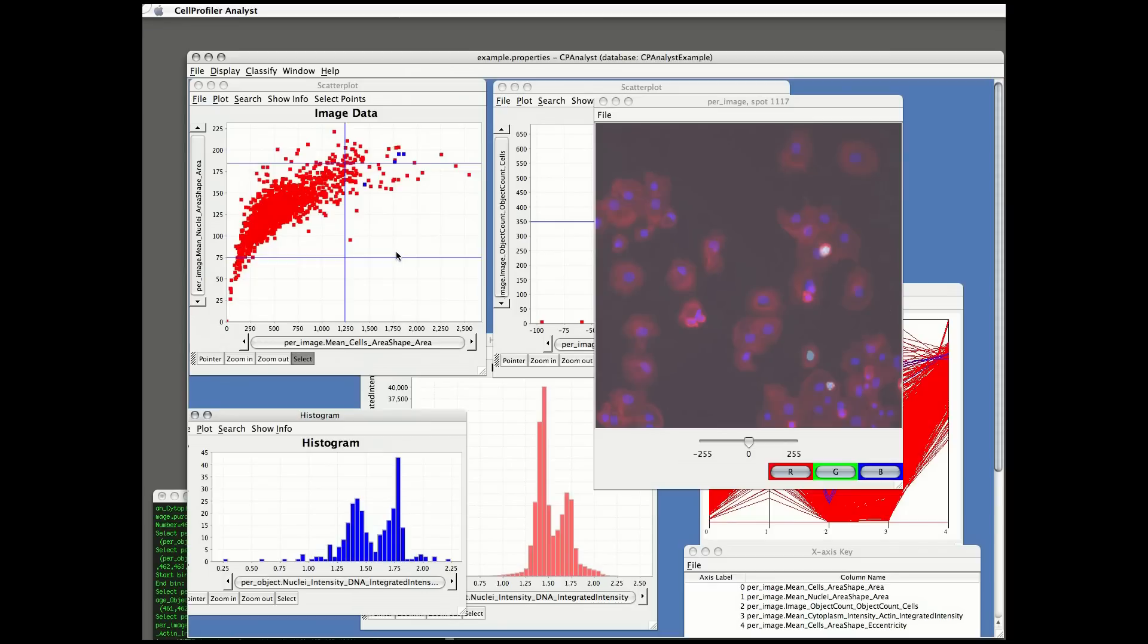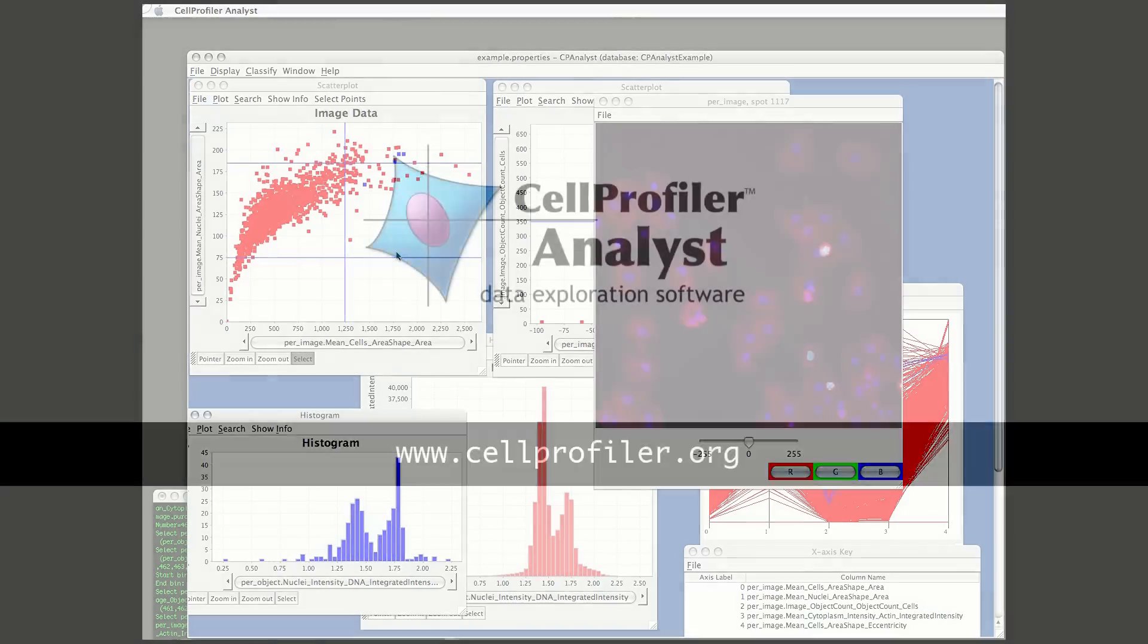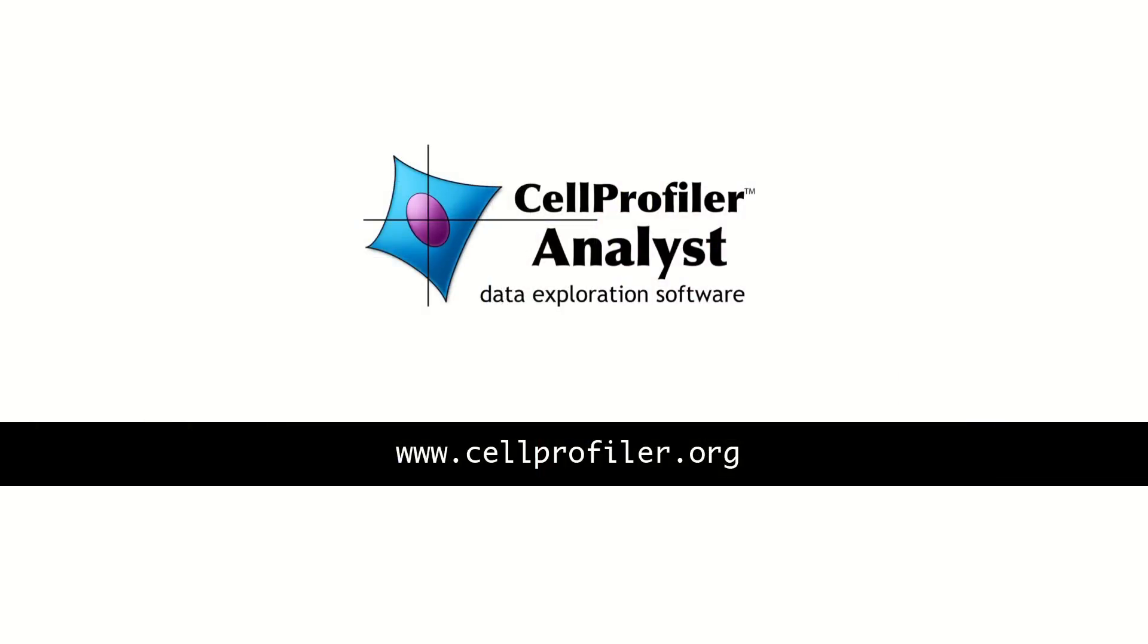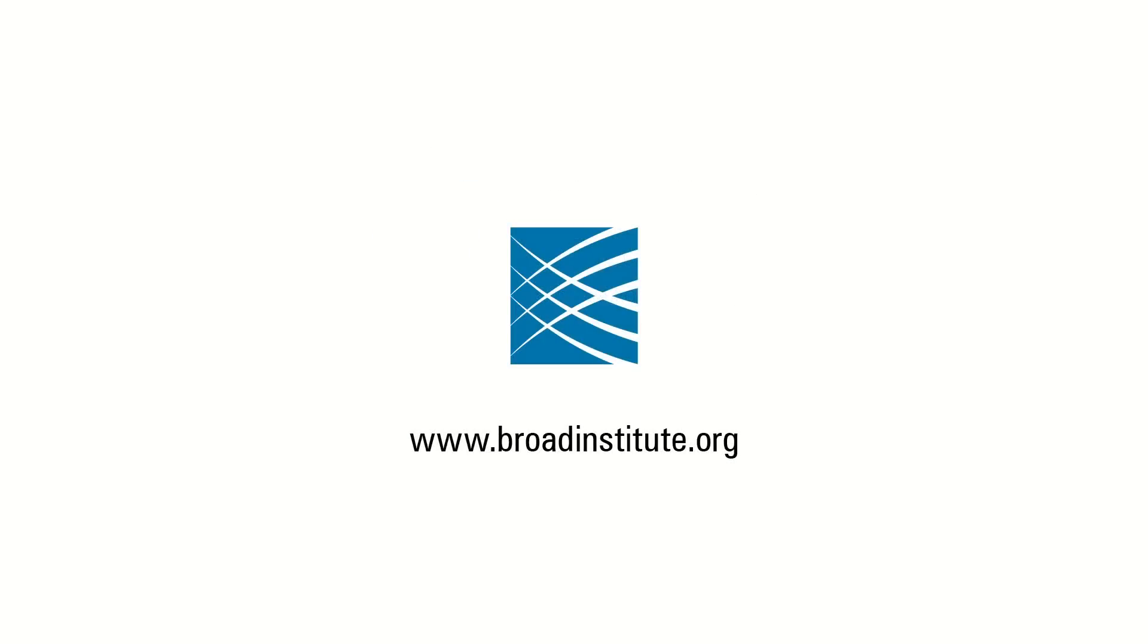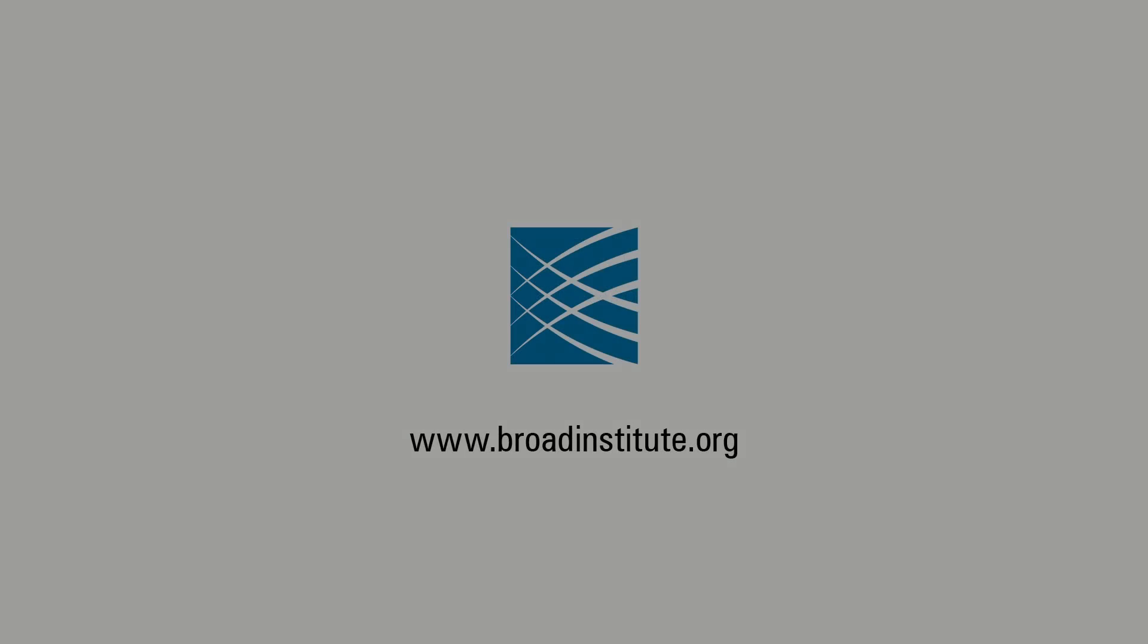This concludes the basics of exploring data in CellProfiler Analyst. Thank you.